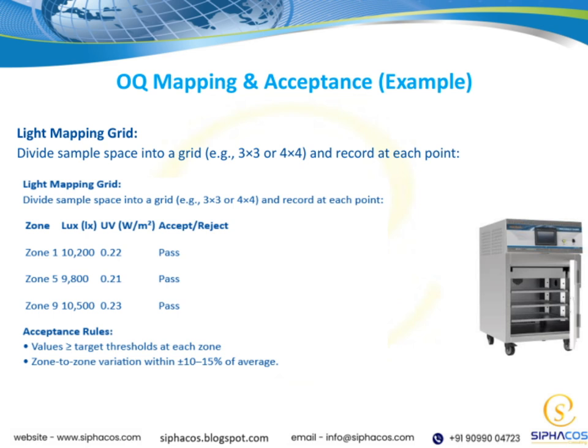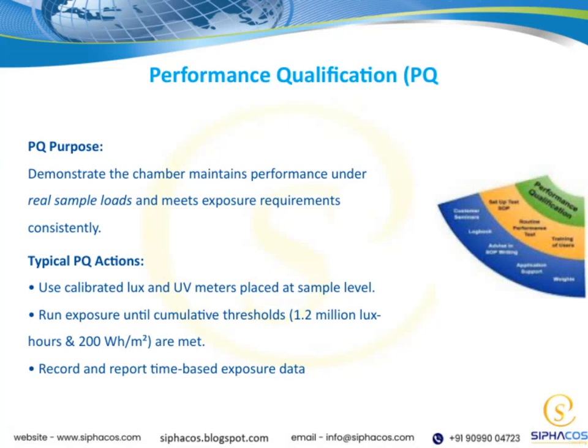Now, let's talk about performance qualification, or PQ. The main purpose here is to demonstrate that the chamber consistently maintains its performance when we load it with real samples, and that it meets the necessary exposure requirements without fail. Essentially, we're verifying that the chamber performs as expected under actual operating conditions.